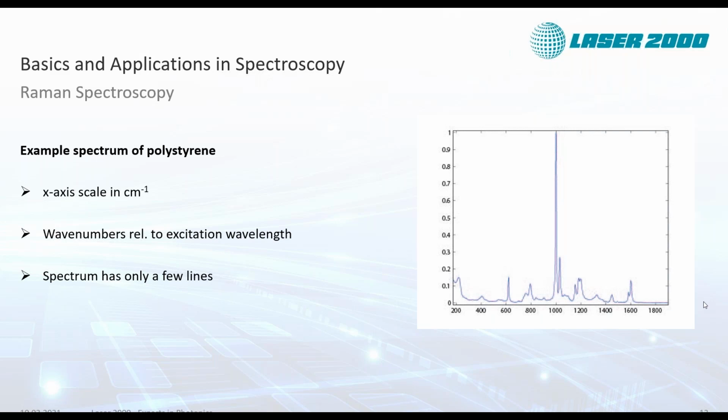So on one side, you have great comparison to infrared spectra, which are also noted in wave numbers, but in this case they are absolute, which is a measure of energy.